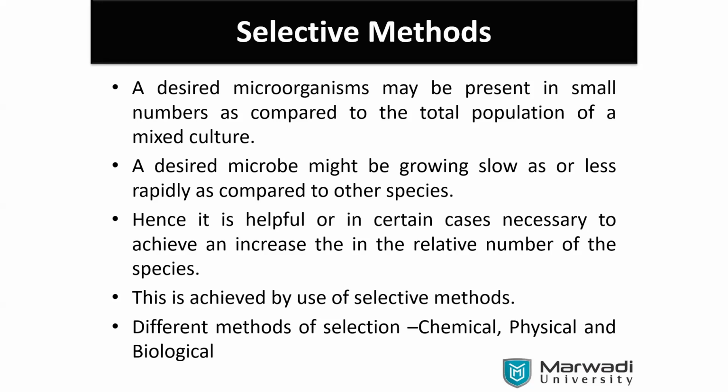But the other bacteria, while opening or while doing the experimentations or handling, error is there. It proves that we haven't cleaned maybe our hands properly, or while doing the experimentations, we were busy in other activities. That is why I'm showing you. After a few days, if you are going to do the same thing again and again, you will get the same results.